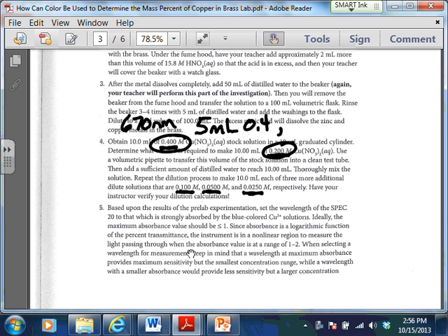So you're going to have to take that 0.4 molar and get that diluted down fairly quickly. I will have volumetric pipettes for you guys so that you can do that exactly, because you want to make sure those concentrations are pretty exact, right, so that you get good graphs. That's the main thing that's going to take you a while. Once you have the solutions made, actually measuring the absorbance is very, very fast, okay? And then once you have that done, you can measure the absorbance of your unknown, and that's really all the data you need to collect in order to be able to complete the lab.